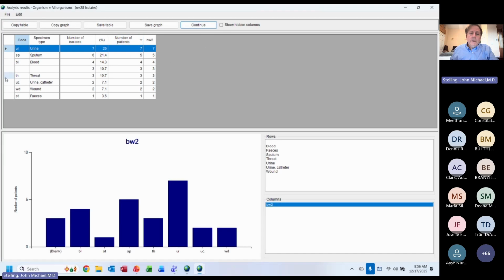Continue. And also, I'm making sure that the values make sense. If I see that the location is Staphylococcus aureus, it means I must have made a mistake in the mapping. If I see that the age is missing, and I know the age is supposed to be there, then there's some mistake and it's missing. It's either missing in the source data, or there's a mistake in BacLink.